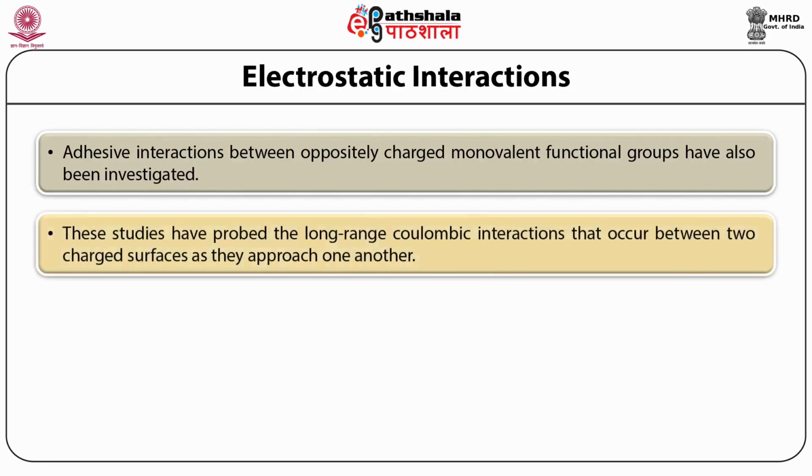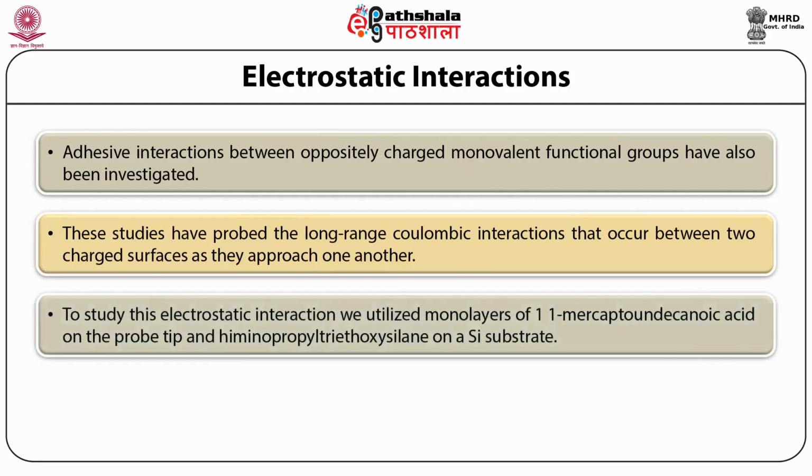These studies have probed the long-range Coulombic interactions that occur between two charged surfaces as they approach one another. In the present study, we were concerned with the role that electrostatic interactions play as two surfaces just separate, that is, the contribution to adhesion, rather than the effect at long distances.